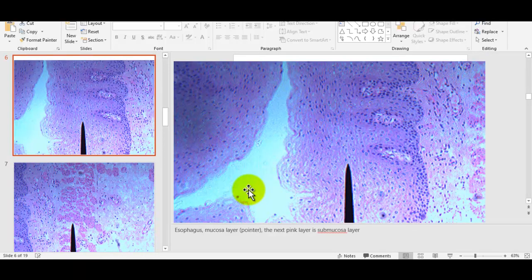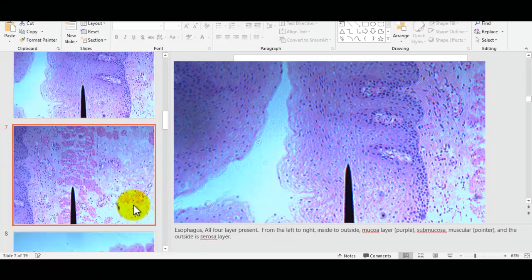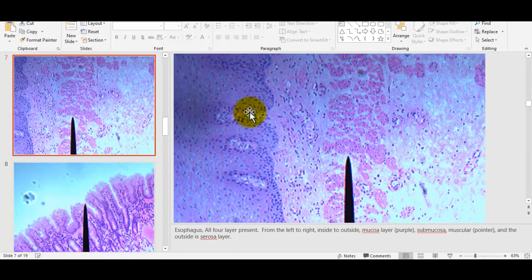The esophagus is hollow. So this big, thick purple layer is called the mucosal layer, and it's epithelial tissue. If you recognize that tissue, this is the non-keratinized, stratified squamous epithelium. The second layer, kind of pink colored, is the submucosa. So if you go from the inside, now here's that purple layer, you just can't see the lumen on the other side. Here's the purple layer.